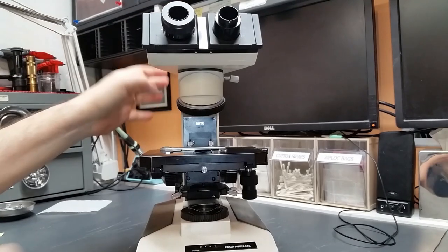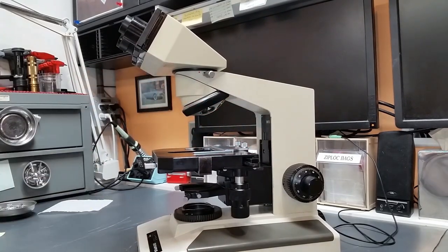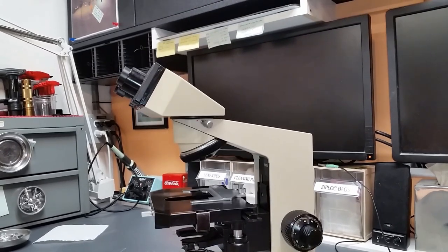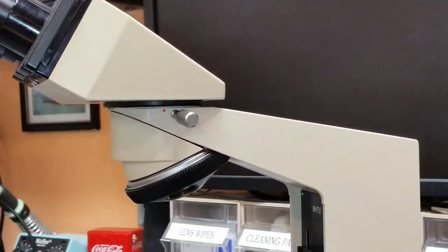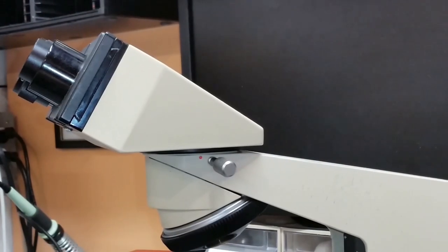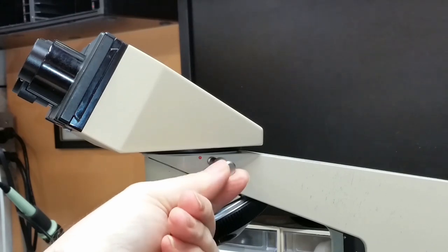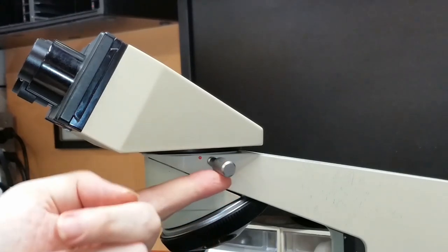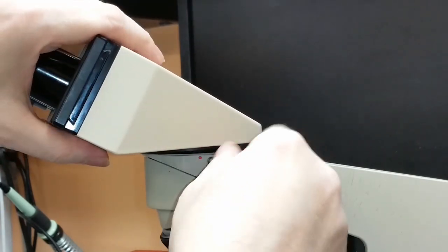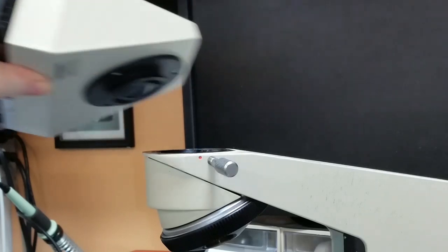Let's start by removing the binocular head from the stand. This is a BHTU scope. Since this is a BHTU scope, this thumb screw works a little different than it would if it were a BHT or a BHS. On the BHTU, you basically just loosen this guy up — just keep loosening it until the head comes out. It's pretty simple.